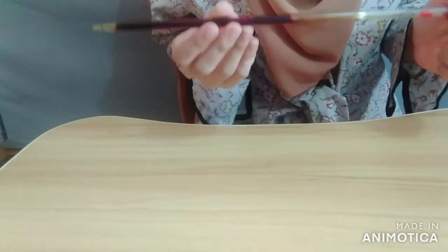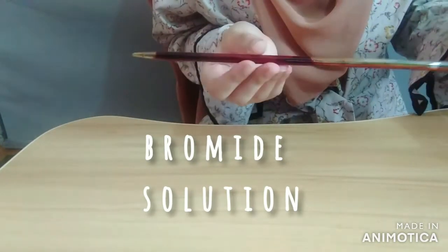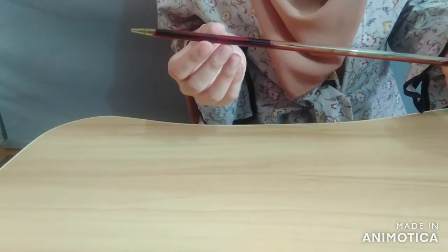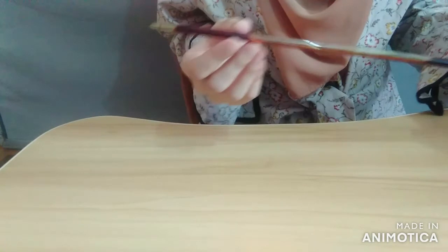So now I'm going to show you how the bromine water test is conducted. Place the bromide solution inside a burette, and before we start, make sure the whole procedure of this experiment is done inside a fume cupboard to prevent any high risk of harm to the user.